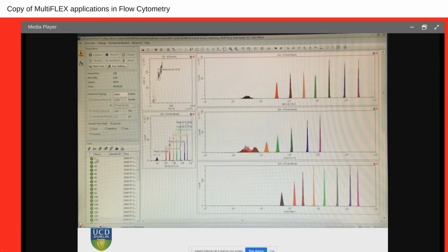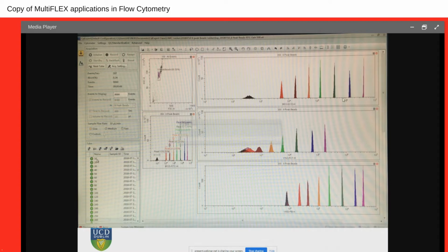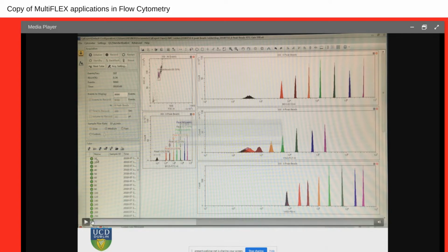They're becoming very, very sharp. These ones are becoming smaller. And one of the things you will find is that this peak here suddenly arrived at the maximum position. It saturated the detector. And this next one will join. So that means that we are losing the capability of resolving very bright populations. So keep going. Let's play.